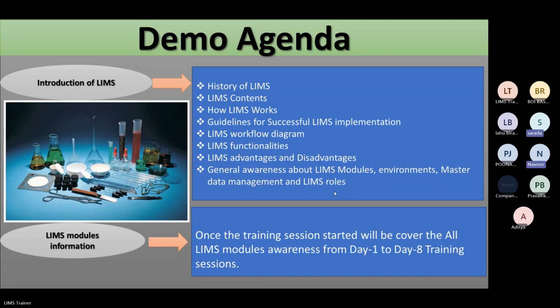Once you give the LIMS training, do you give any practical exposure for us? Okay, see, here we consider one Labware LIMS software. So it's not possible to share the actual software or the actual login, because that is not feasible.